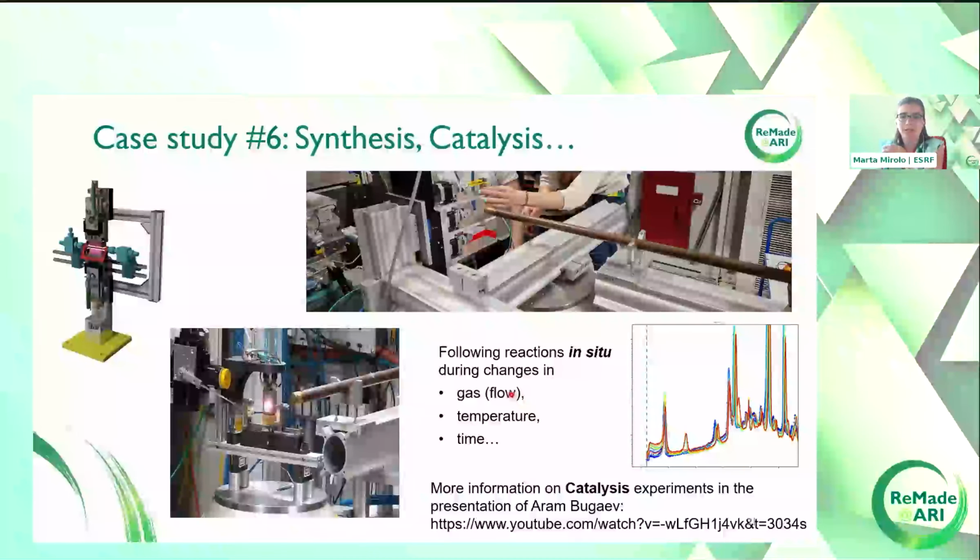Depending on how much pressure you're putting on the capillary, you can change the temperature, you can look at evolution in time, and you can look, for example, at the appearance of different peaks. You can see how different phases are disappearing and so on. And if you want to learn more about catalysis, especially, my colleague from the Smart Science cluster, Aram Bugayev, already gave a presentation, so you can find it on YouTube and you can learn more about catalysis, especially in situ measurements. So I'm approaching the end of my presentation.